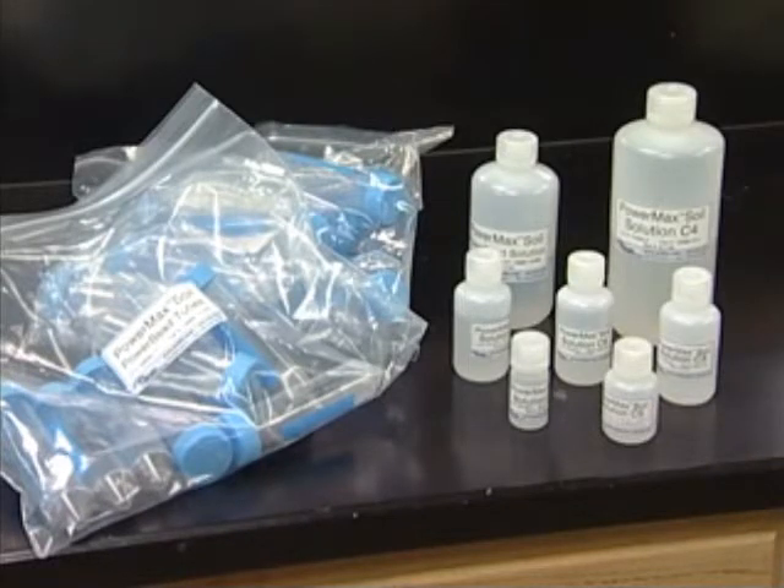In the kit, you will see a wide range of solutions in labeled bottles, as well as a few different bags of tubes and filters. When adhering to the standard extraction protocol, each of the solutions will be used in numerical order, but I will be outlining the purpose of each solution so that the protocol can be changed should other circumstances arise.